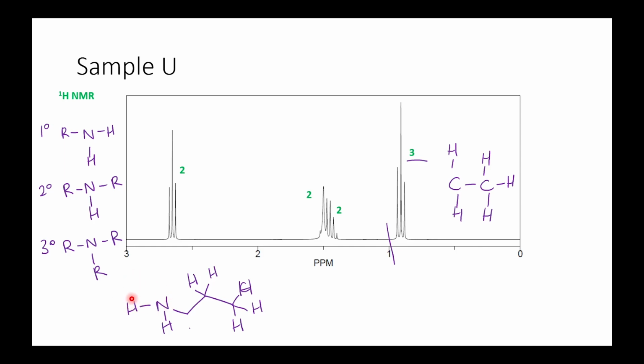And this means that it doesn't matter whether I have a primary or a secondary amine, I'm going to see a broad singlet for these signals. And obviously if it's a primary amine, they'll integrate for 2. And in here I can see this large broad signal, which we've been told integrates for 2, and that is due to my amine protons here.